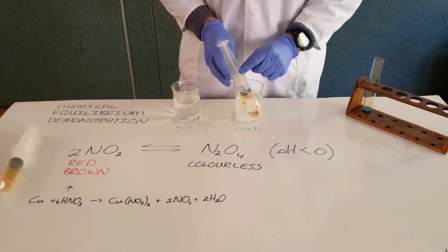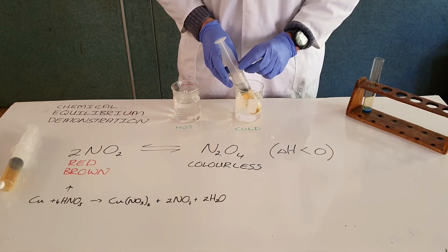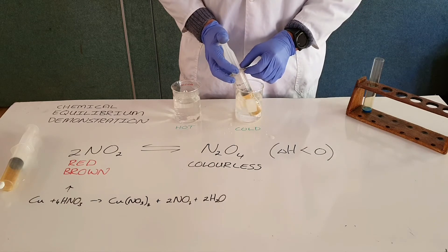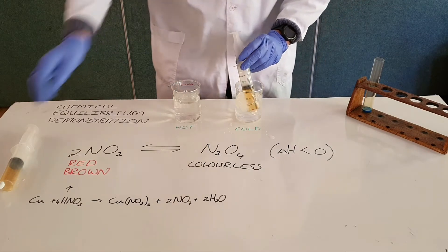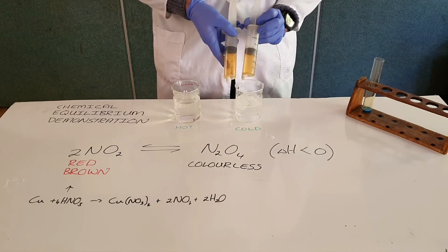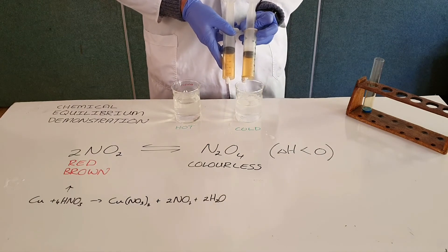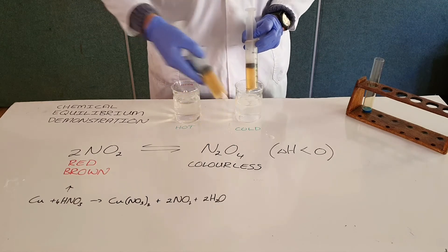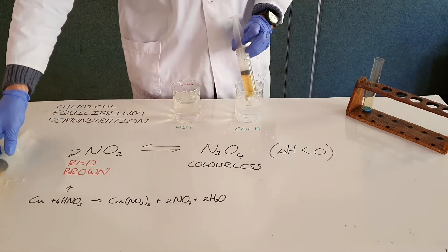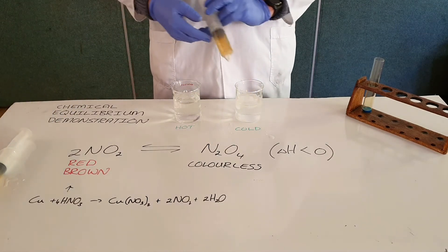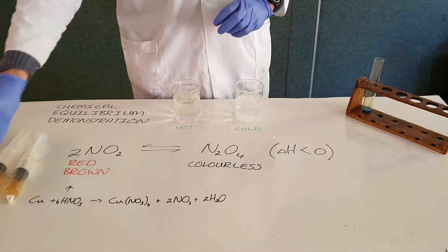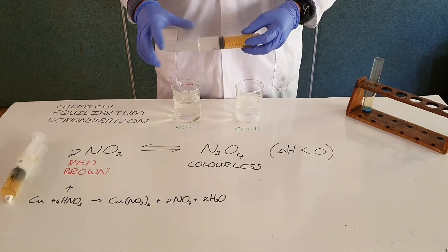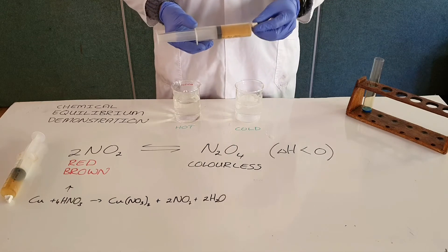That change is going to occur over a slightly longer period of time. While we leave it in the cold water bath, we can already see that there has been a change — this one is now a slightly lighter shade of red-brown because we have produced more colorless gas by favoring the forward reaction.